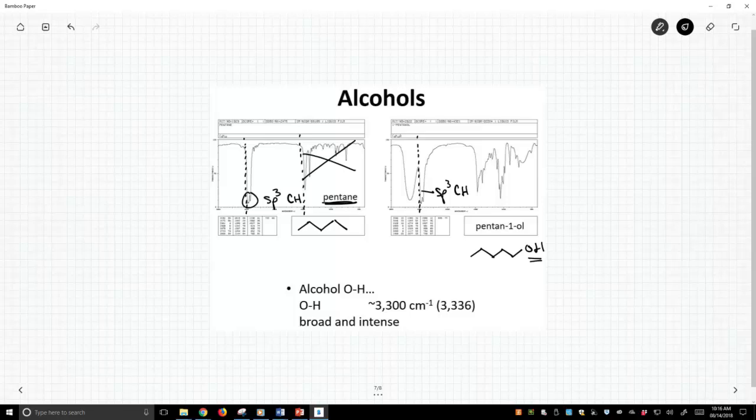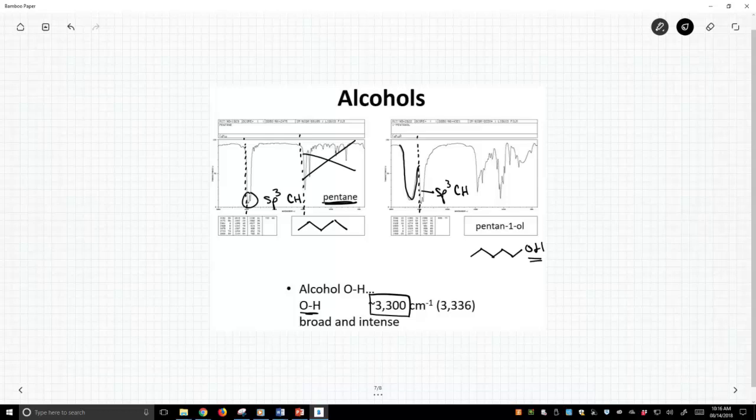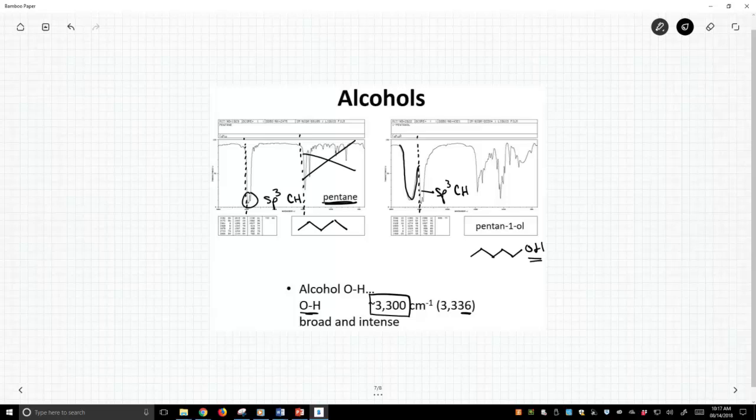But now there's this new big, broad peak, and it's well past 3000. So typically alcohols, this OH group shows up around 3,300 wave numbers. It doesn't have to be exactly 3,300, and you can see this is 3,336, but it's in that 3,300 region.